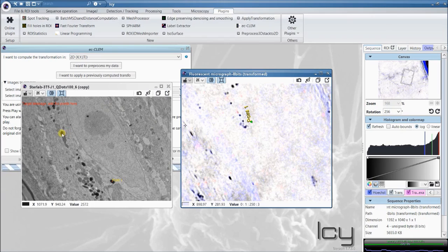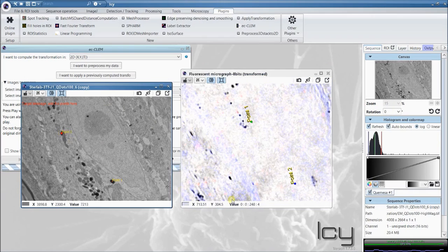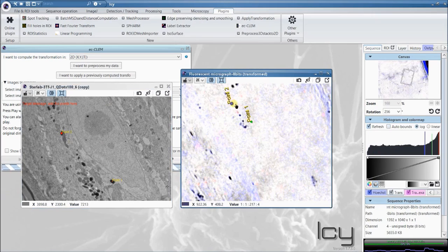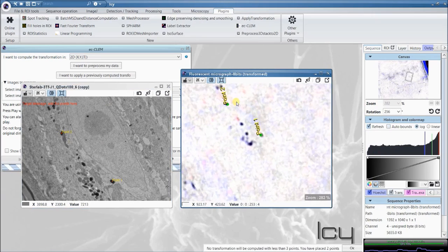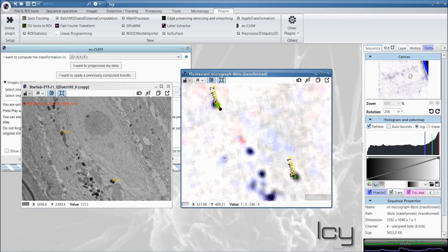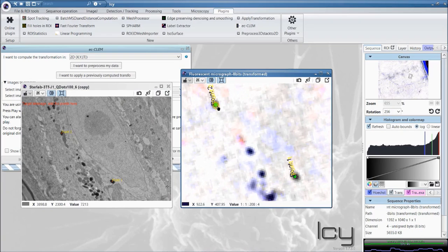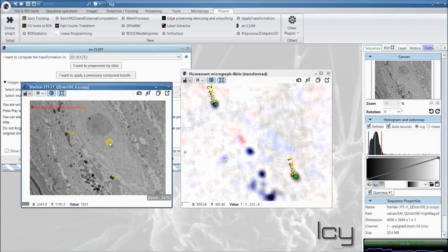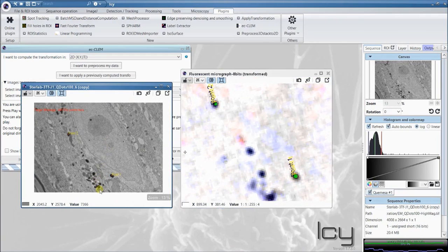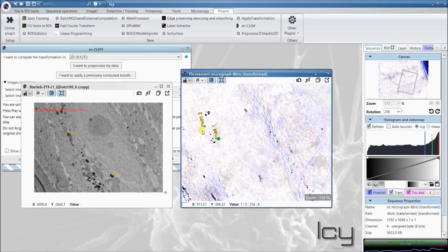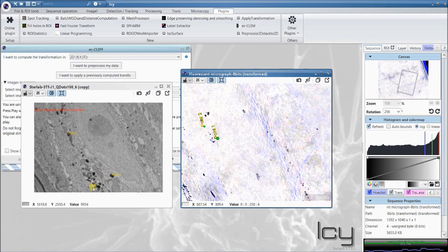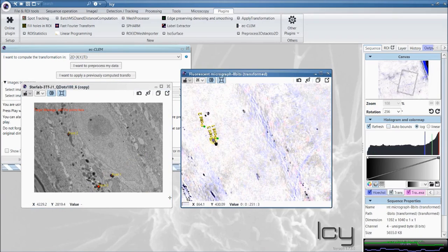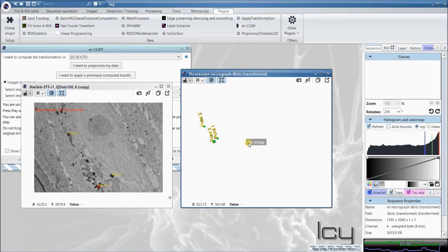Select the second melanosome here and drag it. You can zoom in and adjust it the way you like. Now, place a third point. When you zoom out, you will see it appears again in the center.